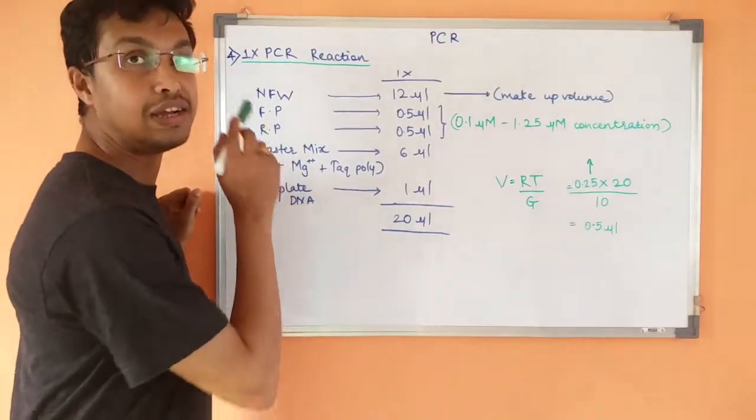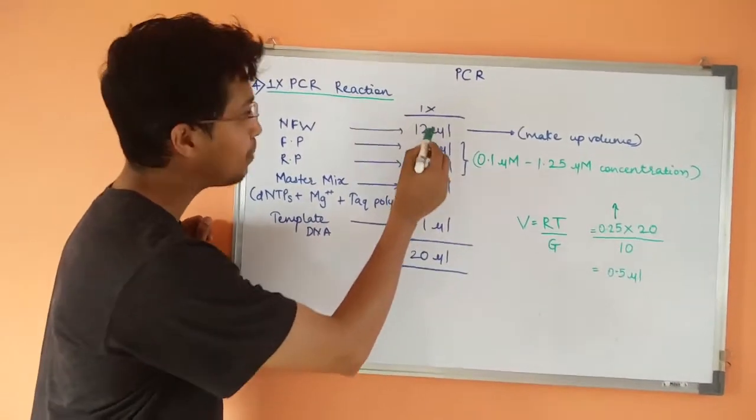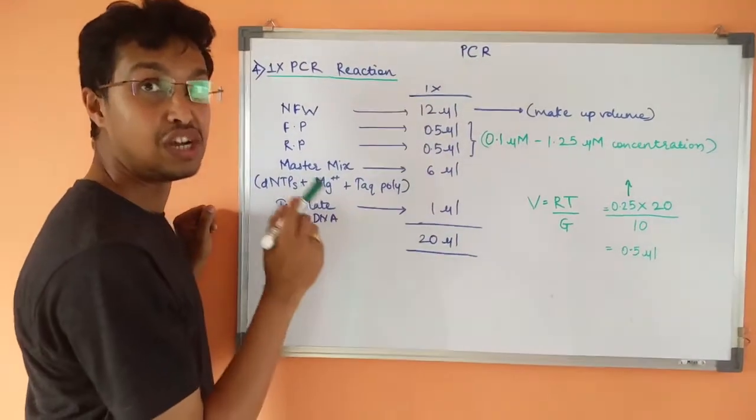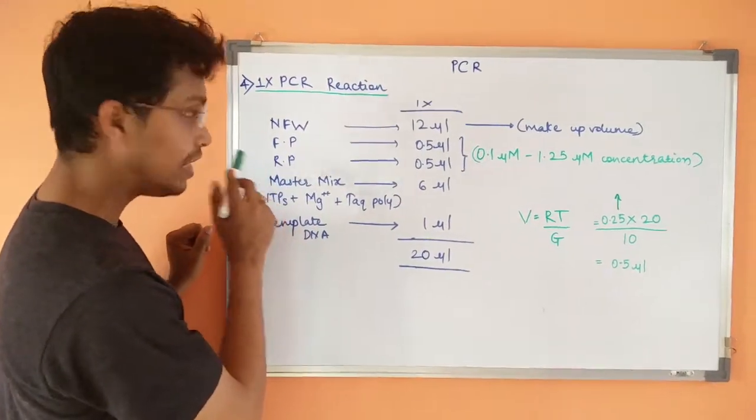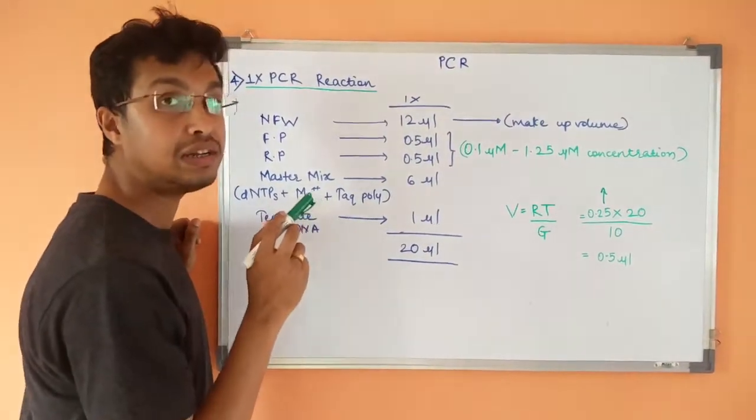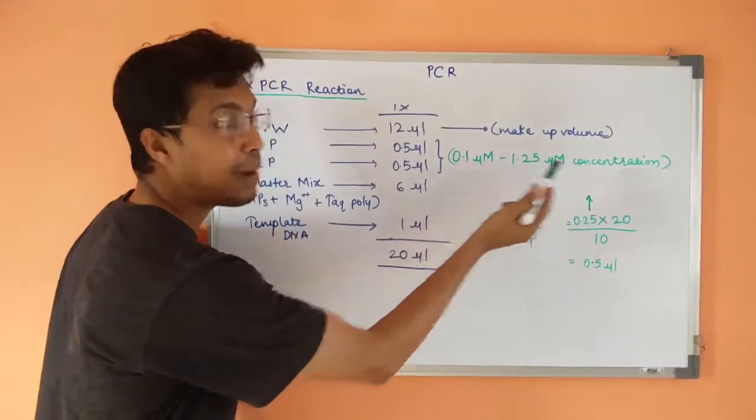To start with nuclease-free water, we are going to add first because it is having maximum volume. I am going to add 12 µL of nuclease-free water. After that, I am going to add forward primer and reverse primer. The concentration will range from 0.1 micromolar to 1.25 micromolar.